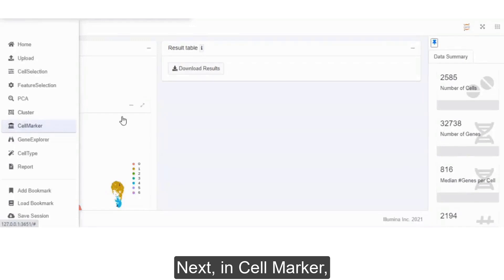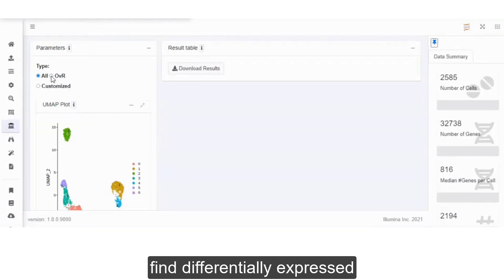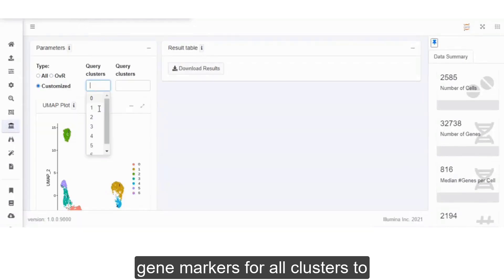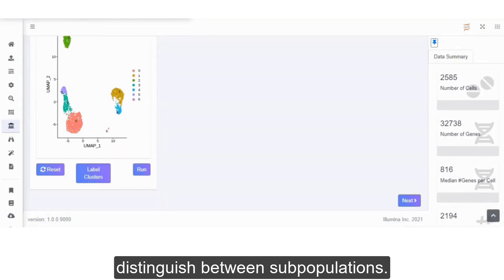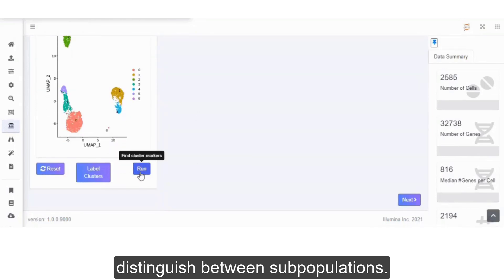Next, in cell marker, find differentially expressed gene markers for all clusters to distinguish between subpopulations.